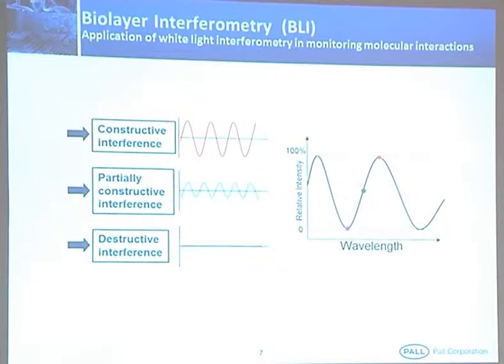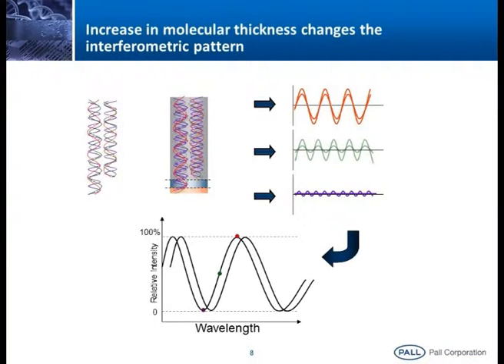The same sensor, when you dip it into, suppose, as I gave an example last time, protein A immobilized onto the sensor, then I am dipping into the corresponding analyte, an antibody. So, suppose the sensor is already coated with protein A. Now, I dip it into the corresponding antibody solution. Now, you can see there is an orange thickened layer. This is due to the interaction between protein A and the antibody. Now, you can see light gets reflected back from here, earlier it was from here, now from here. Due to this, you can see there is a shift in the spectrum, the path length increases.